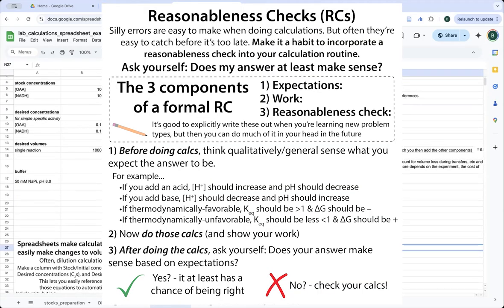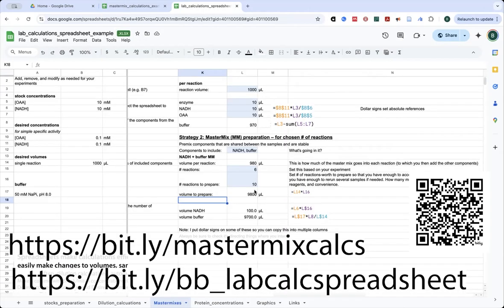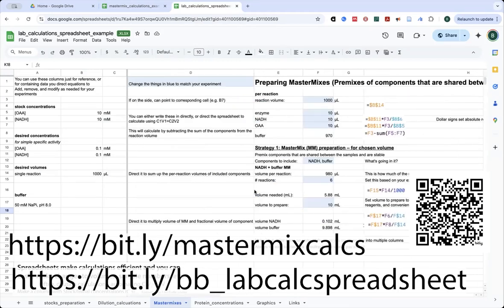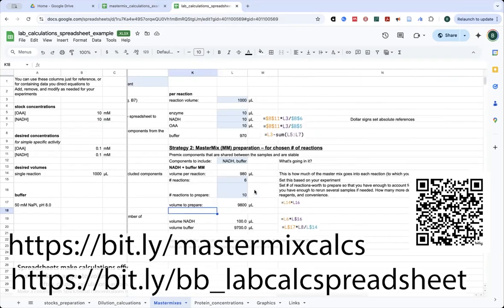And make sure that whatever you're doing, you are checking to make sure that your answers are reasonable. And so that's just making master mixes really, really helpful in the lab. And so hope this helps you strategize when you're setting up your reactions and that sort of thing.